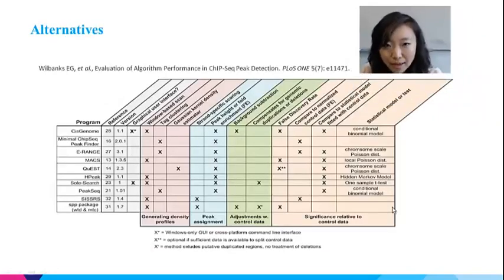I've shown how to use MACS and SICER. Except for these two, many other software tools are available. This table lists some of the popular ones and the functionality of each. Basically, it's a good practice to use a peak caller with window-based scan, statistical model or t-test, and that gives a false discovery rate. Based on their algorithms, even given the same dataset, each software will identify similar but different peaks. Trying different reliable peak callers and taking the consensus peaks is also a good strategy if your time and resources allow.